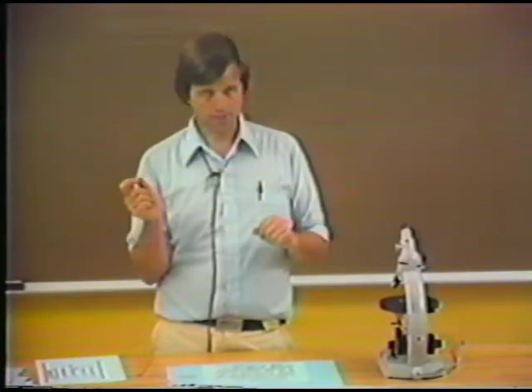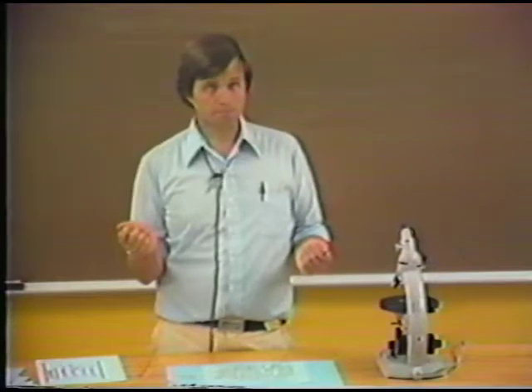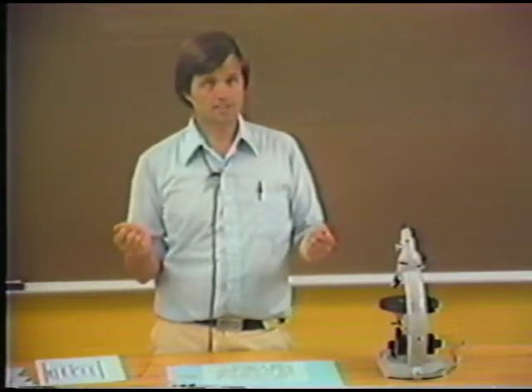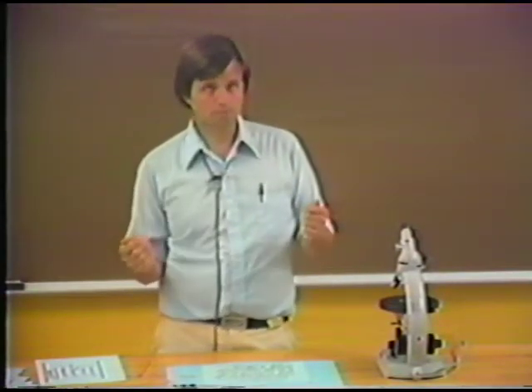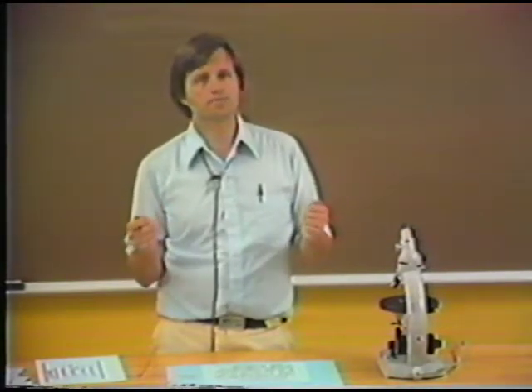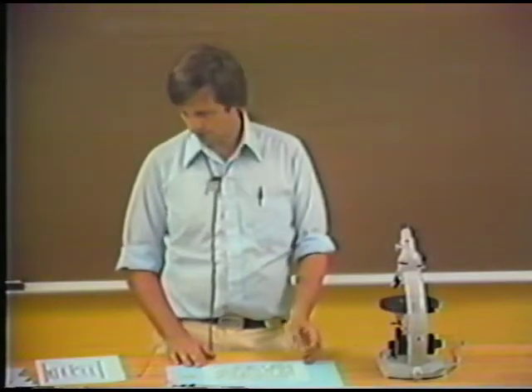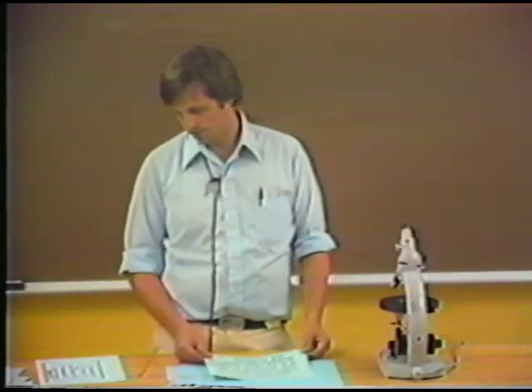Take out the Bertrand lens and converging lens. Look at it in cross-polarized light and rotate that mineral grain until it gets to extinction. And if you've rotated in the proper sense from the northeast to the east-west, then you know that the E ray is precisely east-west, parallel to your microscope polarizer.